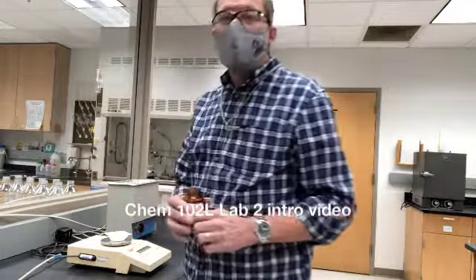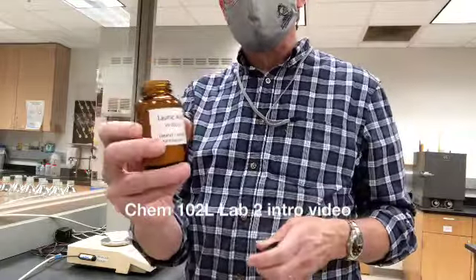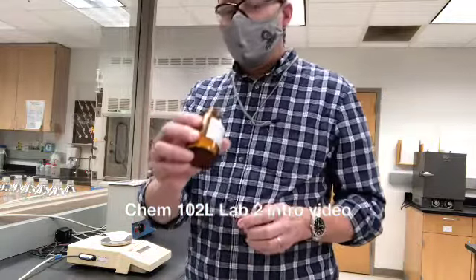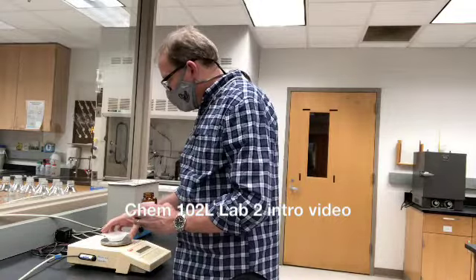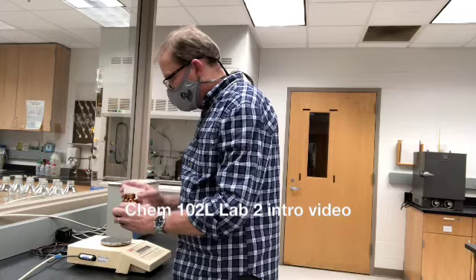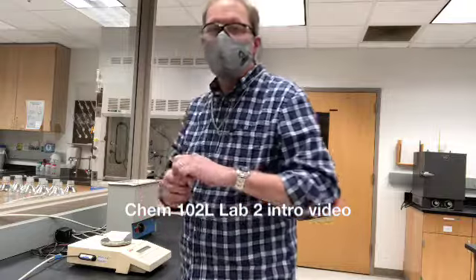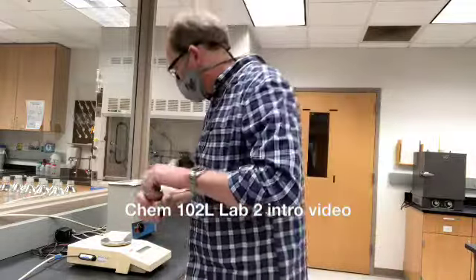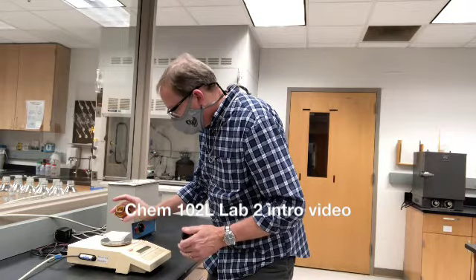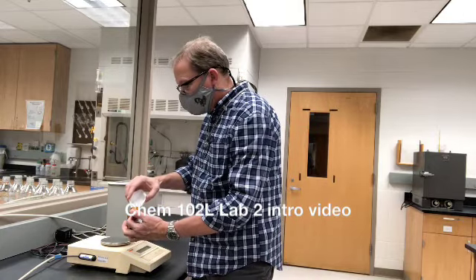Now normally in a chem lab, we wouldn't want you to put things that you've already removed from a chemical bottle and put them back in. And in this lab, because we are working with these smaller amounts and I have these big chunks, it's best if I didn't have this really big chunk in here. And so I'm going to pour it back in, and I'm trying to avoid having big chunks. So maybe I need to kind of get rid of that big chunk in there. I'm at 2.65, and now I'm at 4.33. That's a little bit over. I can put a little bit back in here.